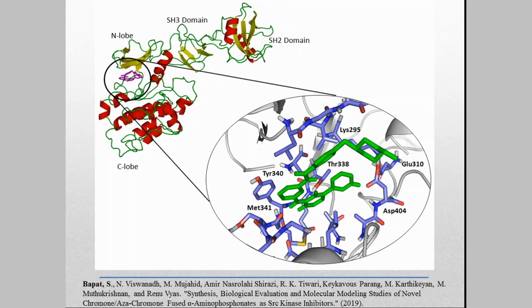What we do in docking is that we search for an appropriate binding of the ligand that fits energetically and geometrically to the protein binding site. In this case, this is your protein binding site, the green one is your ligand. This is zoomed here and the blue ones are nothing but your interacting amino acids.